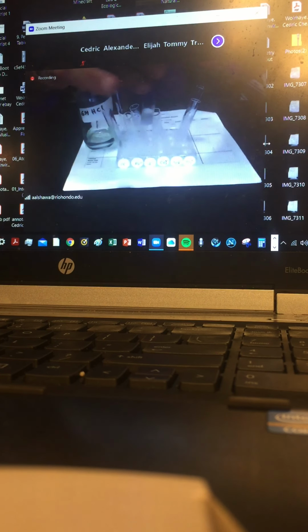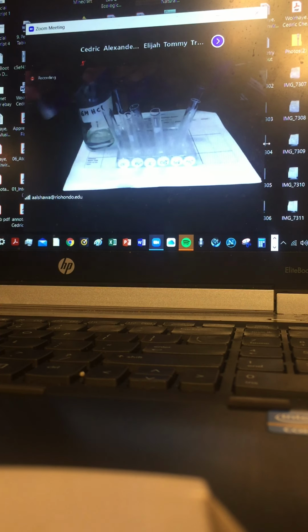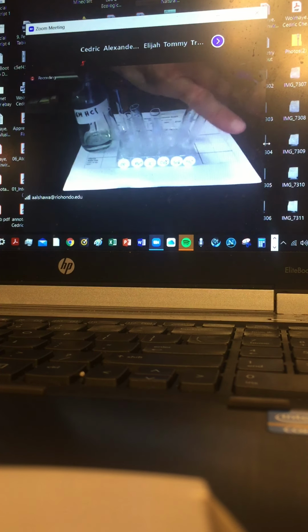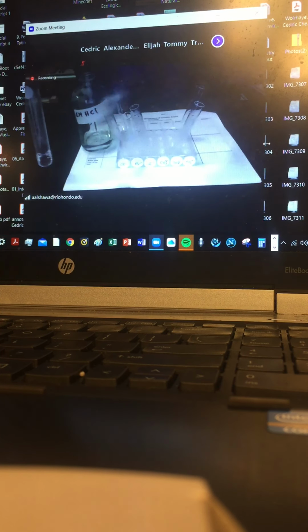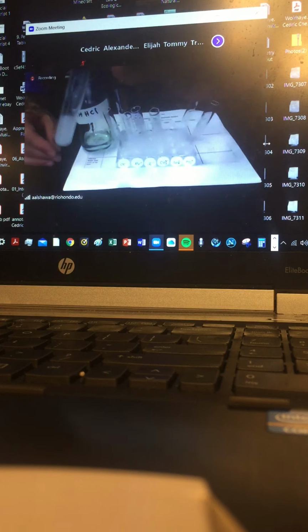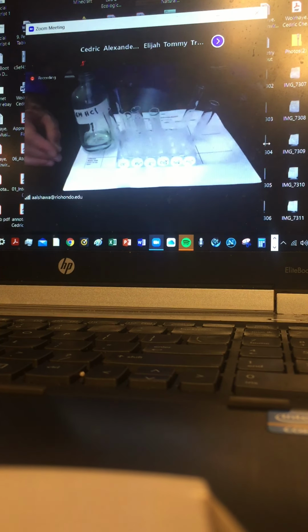Now I'll do the same. So here's my phosphate. So there's sort of a cloudy solution. Let's see, upon the addition of a few drops of the acid, it turns clear. Okay, so the solutions clear readily. So carbonate clears, phosphate clears. What turns out to be positive for that test, even with the harsh acid, is the sulfate. So barium sulfate is resilient and resists dissolving.